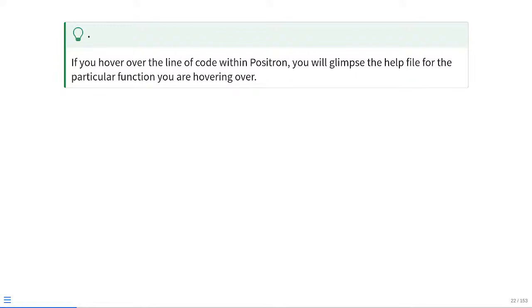Setting up with GitHub is much easier. Finding those help documentation files is much easier to do. And there's a bunch of other things; it also allows you to use multiple languages if you wanted to. Because they're made by the same company, all the things that those who work at Posit have seen over the years as being trouble points have been fixed and patched in the newer version, Positron. Also, I'm concerned that RStudio is not going to be maintained long term. It will be discontinued starting after next year, at which point I would have to rewrite all the documentation.